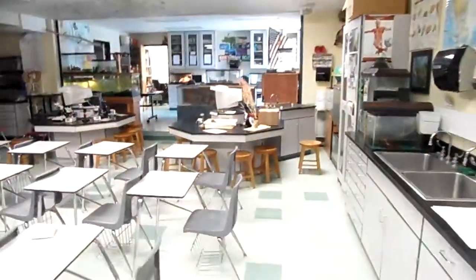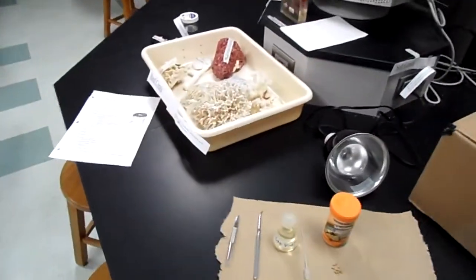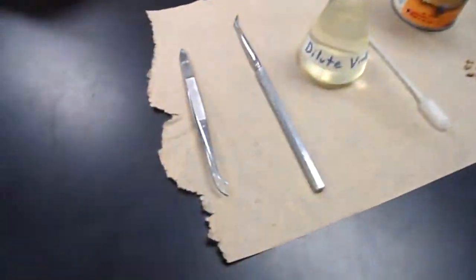So you'll notice the lights are out in the classroom, and the anemones are on the first lab table and they're covered up with a box. So I'm going to turn the classroom lights on. They've been under the box and in the dark for about a half an hour. But I want to show you the other materials of the lab before we get started working with the anemones.